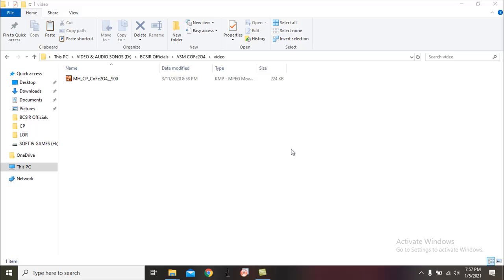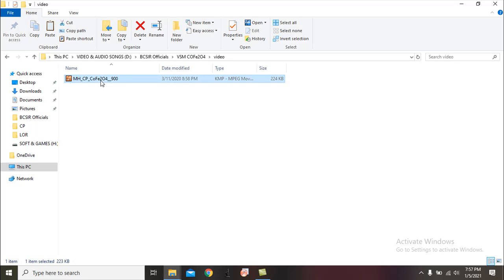Hello everyone, today I will show you how to plot a hysteresis loop using vibrating sample magnetometer data — that means VSM data — by Origin software.